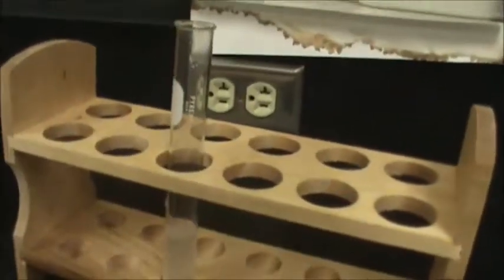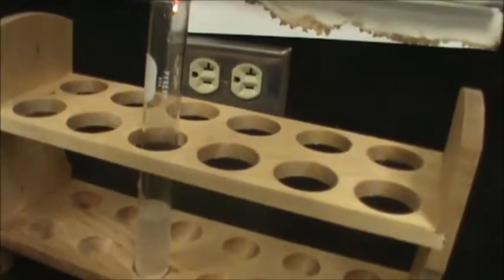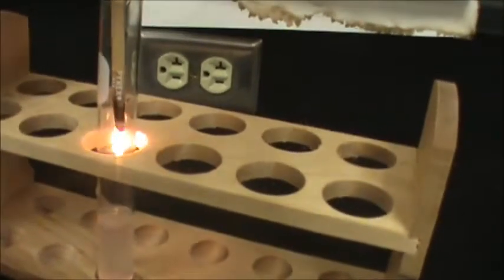Alright, so I caught that on fire. I'm going to blow it out. Oh, come on. This is very flammable wood. Alright, now, if I'm lucky here, let's see what ends up happening. We want to test out to see what gas is present. So here it goes. If I turn it in there, look at that go.